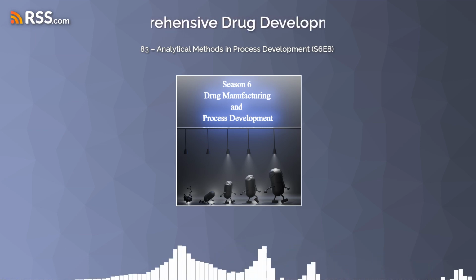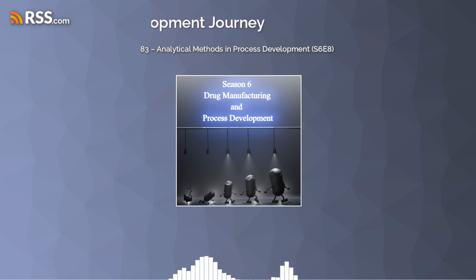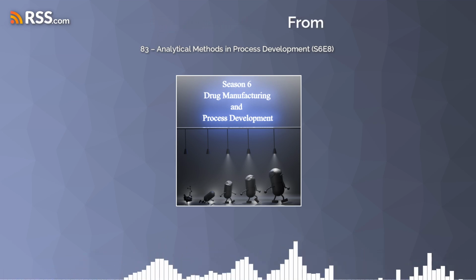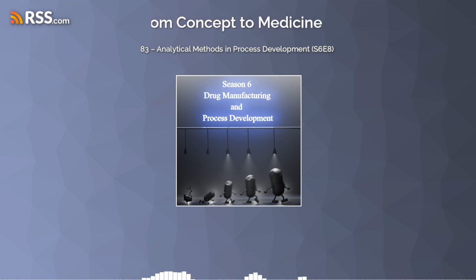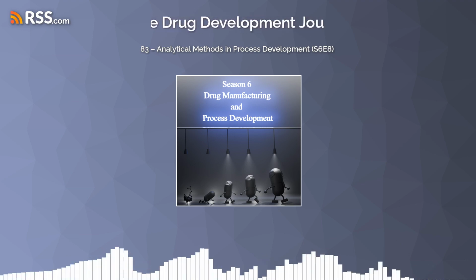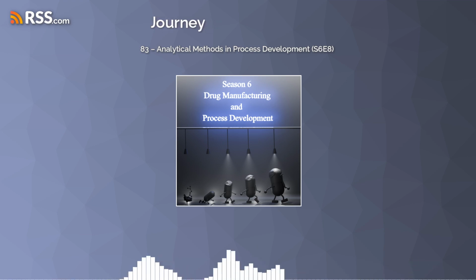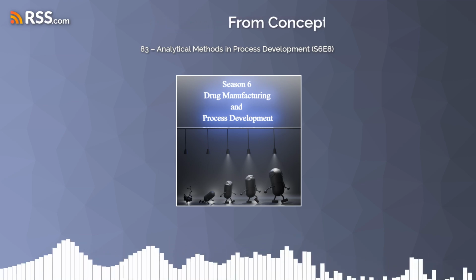Okay, let's move on to OPR&D 2019B, which describes the synthesis of an imidazole compound. And the authors here explicitly state that they used HPLC to determine the purity of their final product, and they achieved an impressive 99.8 area percent purity. Wow, that's really pure. It is, and that high level of purity is absolutely critical for a final pharmaceutical ingredient. Right, because you're putting that into a medicine. Exactly.